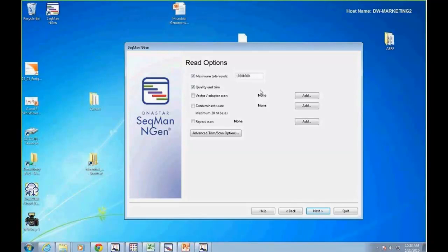What I always recommend is, if you have a de novo data set that you're having some troubles with, it doesn't want to assemble quickly, it's using too much RAM, I always say run a pilot. Just assemble 100,000 reads. Get something that finishes in just a couple of minutes, then take a look at the data and see, is there some identifiable linker present in the data that you need to trim off? That little pilot run can be very helpful.